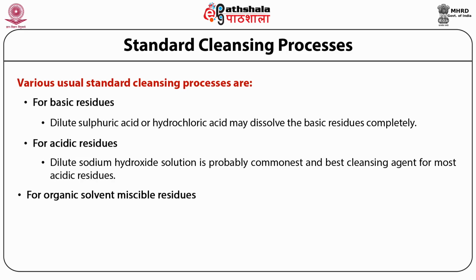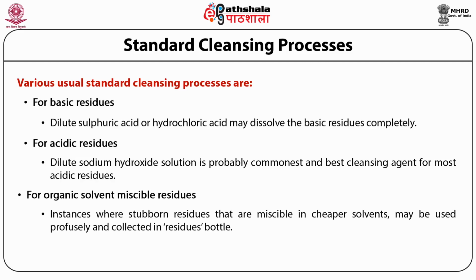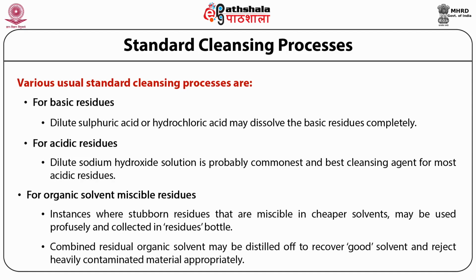For organic solvent miscible residues, stubborn residues that are miscible only in comparatively cheaper solvents may be used profusely and should be collected in the residues bottles and not down the sink. The combined residual organic solvent may be distilled off to recover the good solvent and reject the heavily contaminated material appropriately.